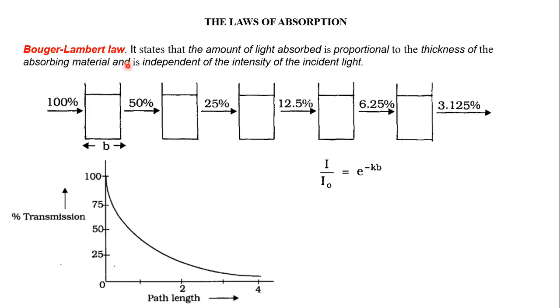Sorry, I couldn't hear you properly. It reflects the red color. Yes, it reflects red, meaning it is absorbing all other visible colors except red, right? Can I say this?